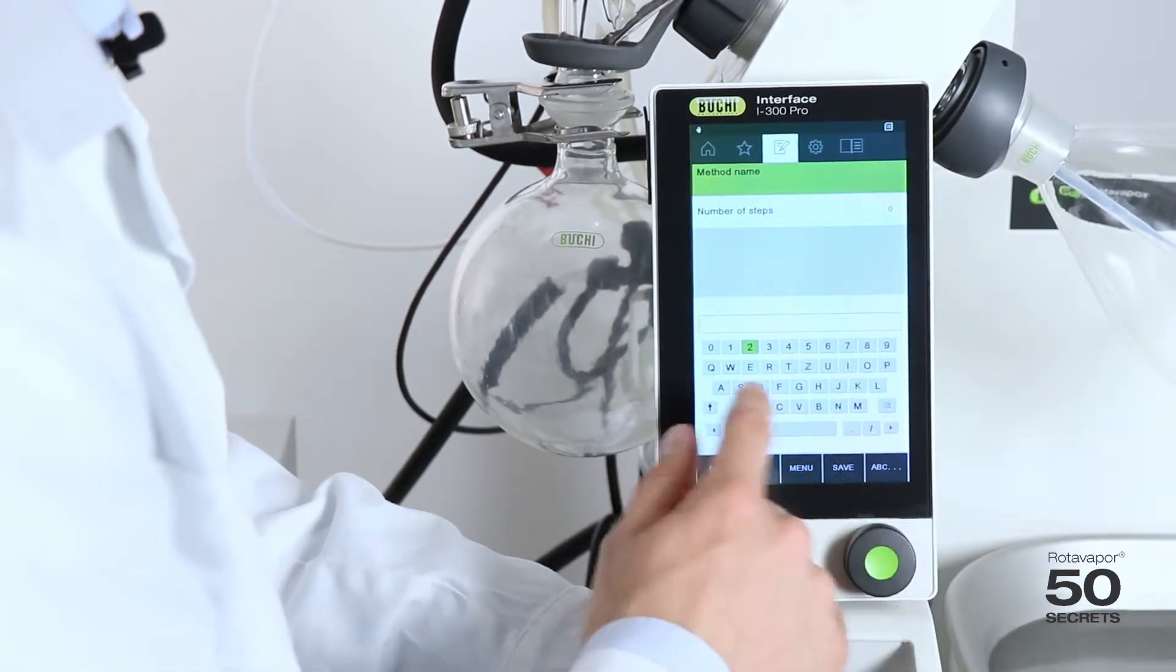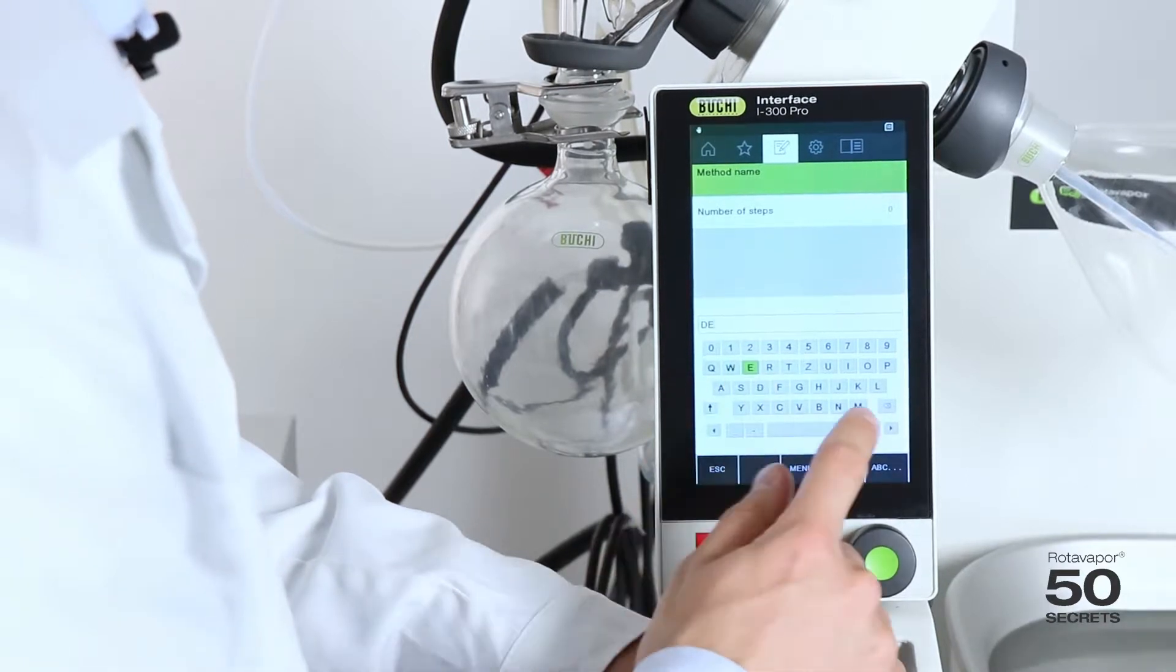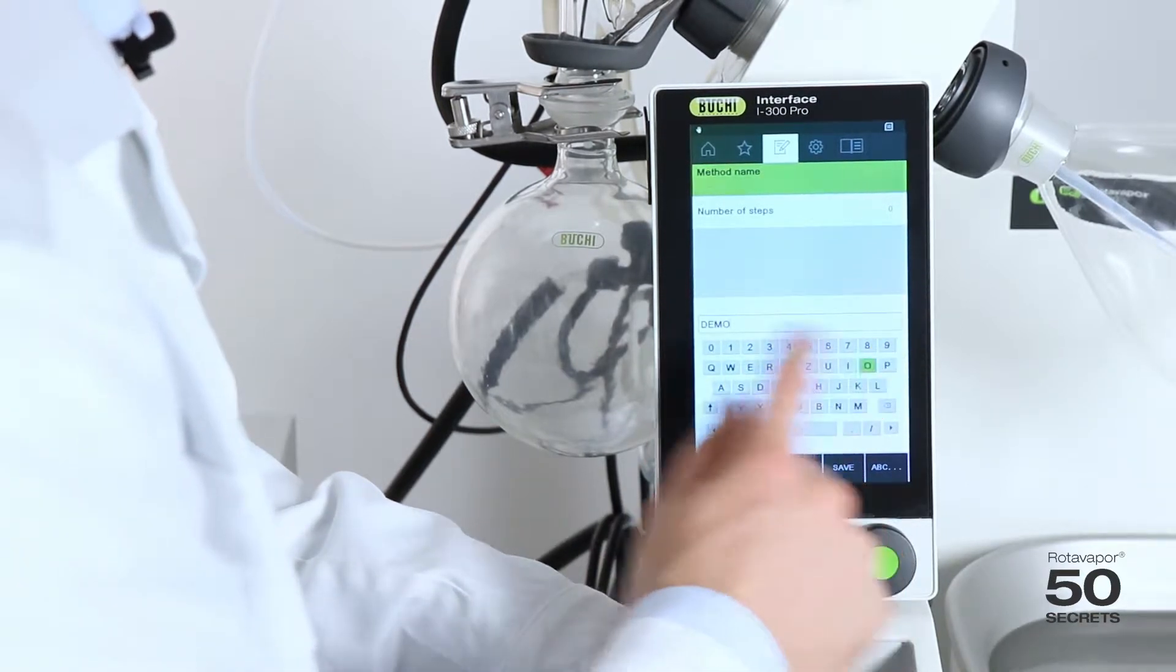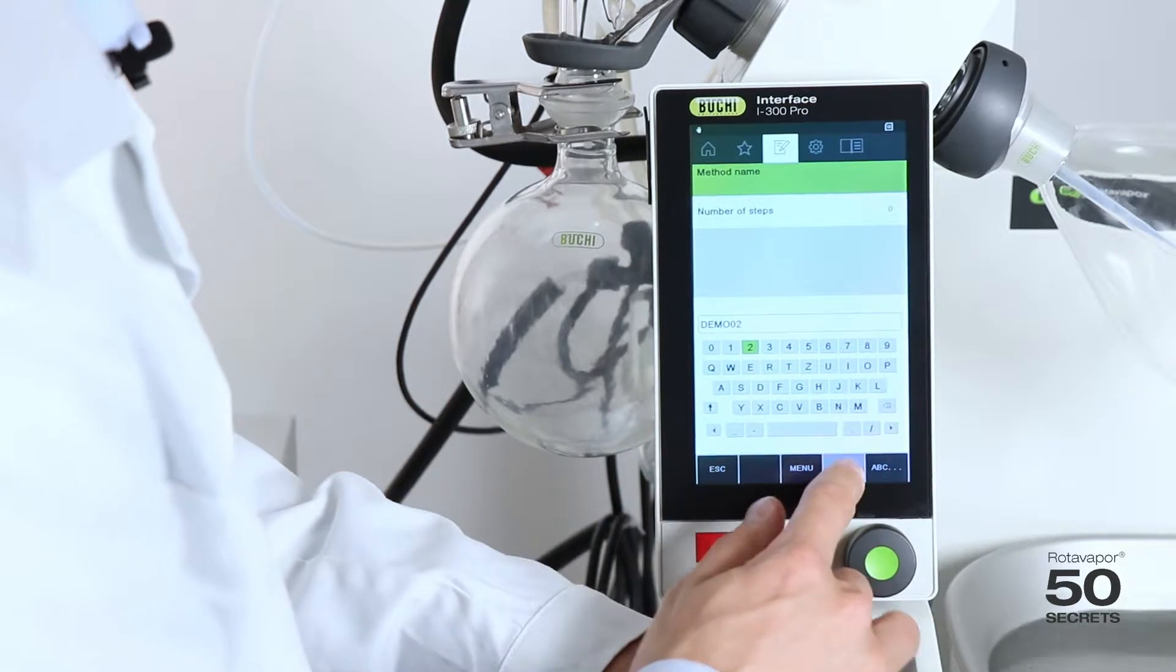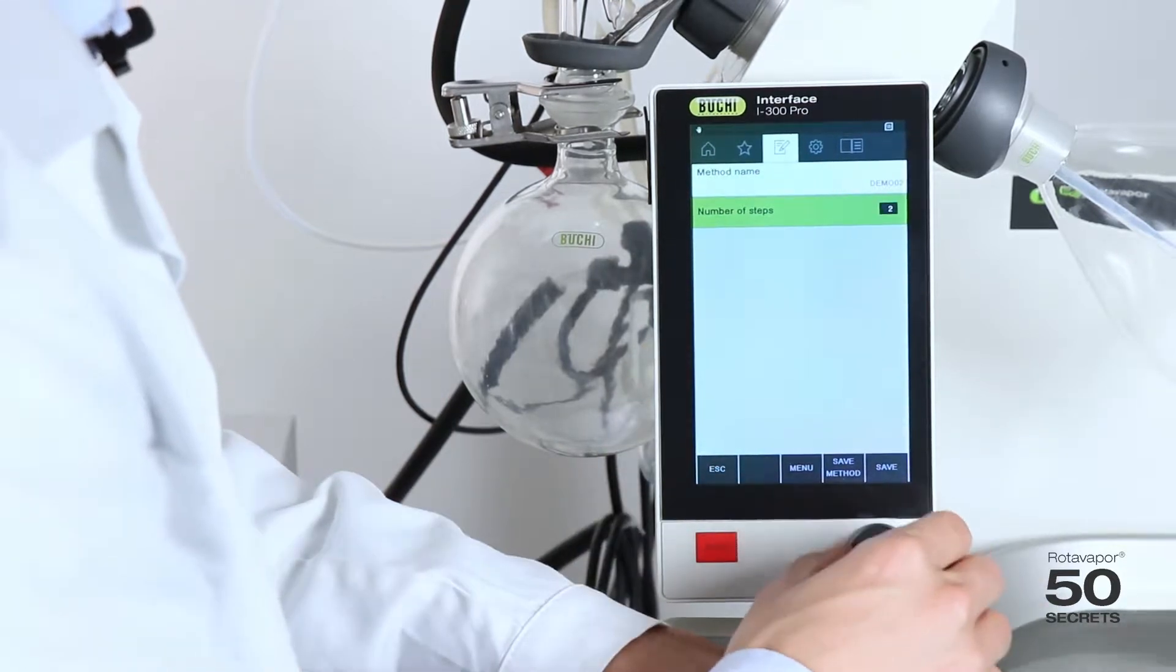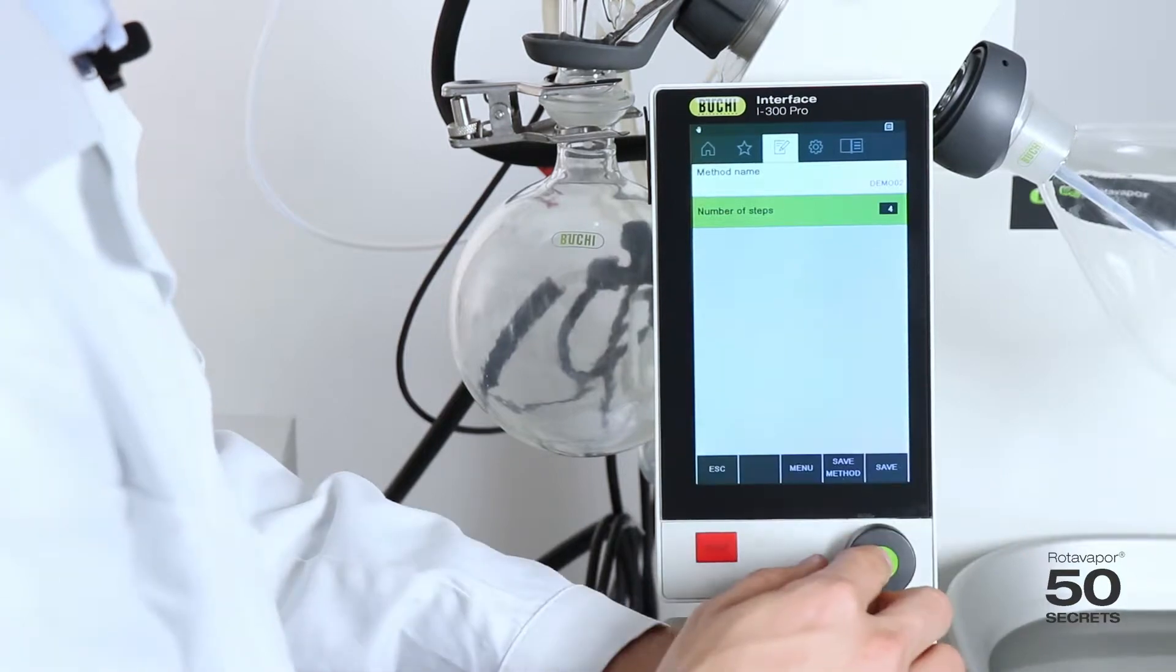Let's give it a name. For example, demo02. And now we want four steps. Four steps over here.